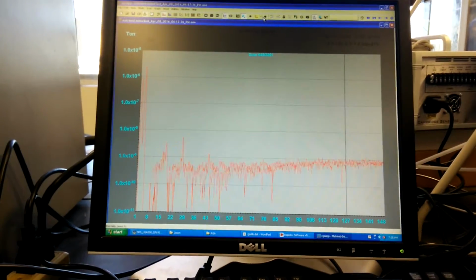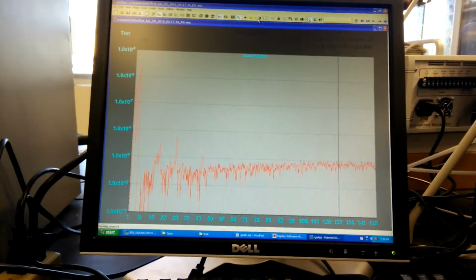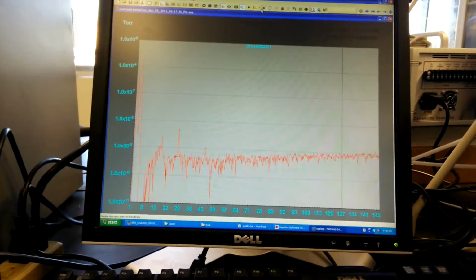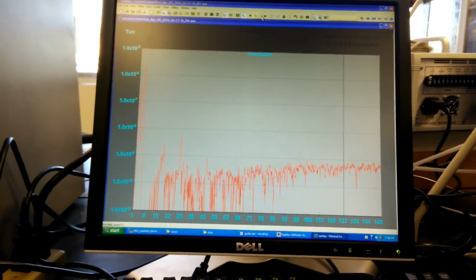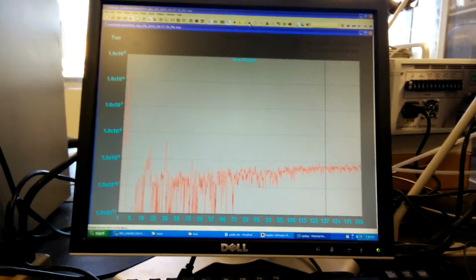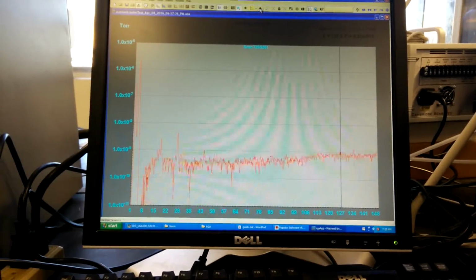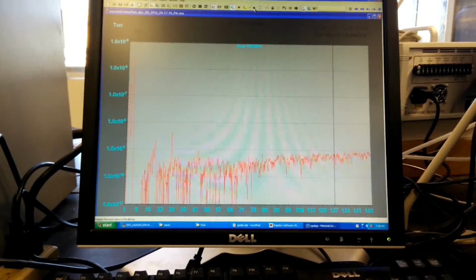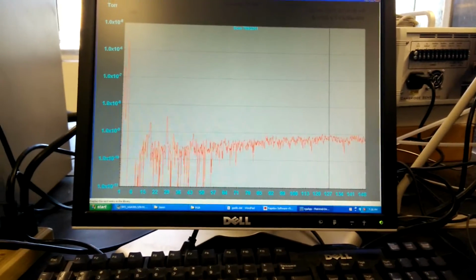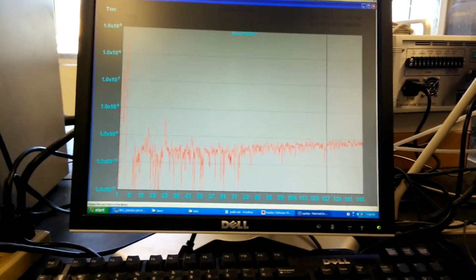So we have reached the 1000 degree soak time, and so now all the peaks are decreasing quite a bit, and right now the peaks will just continue to decrease until the reaction approaches essentially its end, and the composition of the gases coming off will very soon reach the same composition as they started off with, which is the background composition.